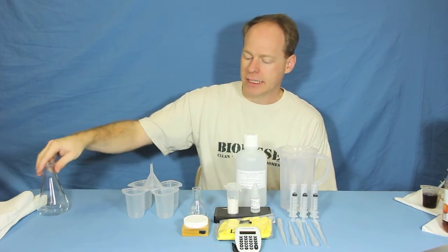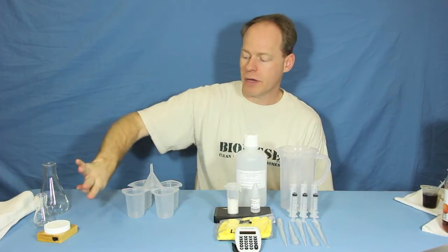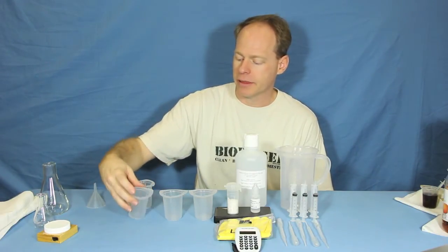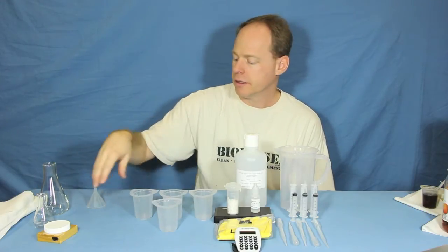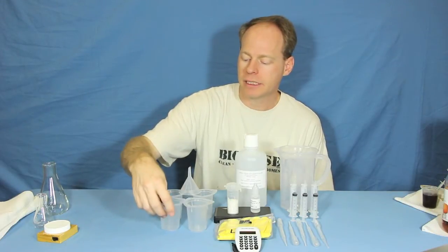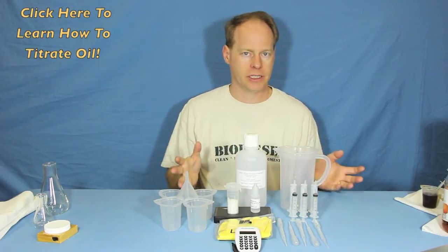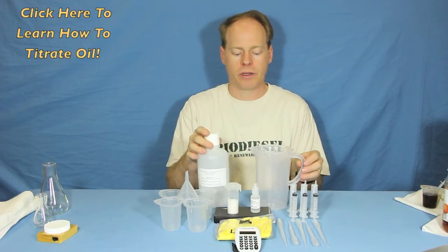Our basic kit is everything you see here minus the magnetic stirrer, plus these tri-cup beakers and the funnel. It basically includes everything that you're going to need — you just don't get the glassware with the basic kit, but it's perfect for doing titrations. If you're checking out oil that you need to make biodiesel with, it's really important.